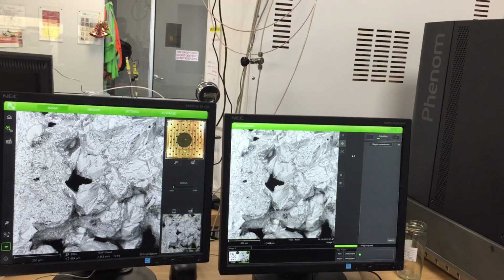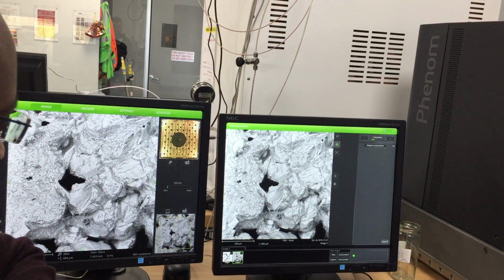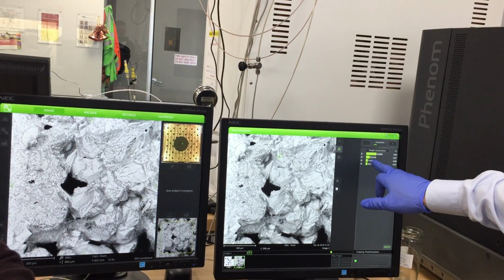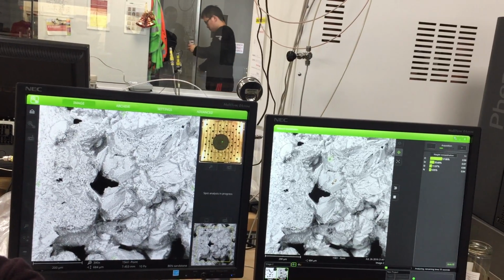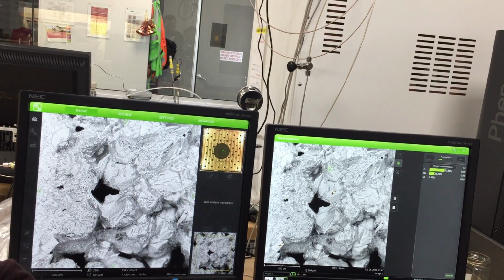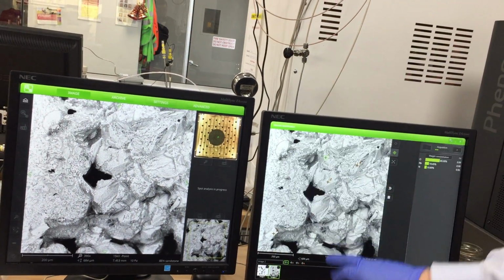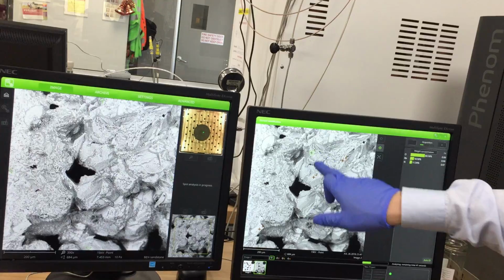Now let's do it. So the first page is where you do spot analysis. Anything that you're interested in getting an EDS analysis of, a particular area, click on that. Green is good. Green is happy. You got silicon, nitrogen, oxygen. You can put up to 10 spots at one time. Whichever you find interesting. Okay, 4, right? It's going to go one after another. At the moment it's the first spot, and then it will continue to 1, 2, 3, 4.